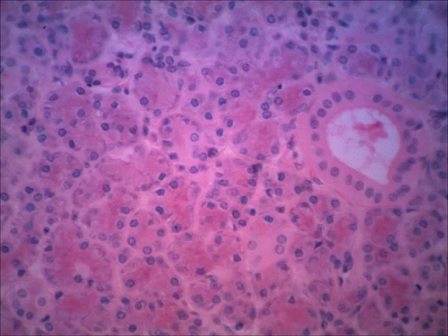You know, you have enzymes produced in saliva, you have bicarbonate ions, you have mucus ions. For the lab, you don't have to know the difference in those cells. Just know those as secretory clusters. And then again, you have the ducts there. So this one's pretty easy to recognize if you look for the two distinct regions, the clusters and the ducts.